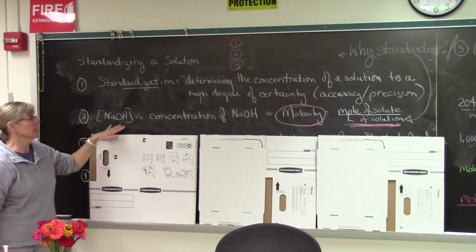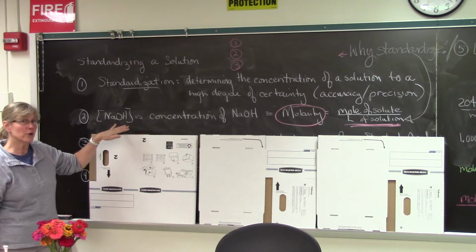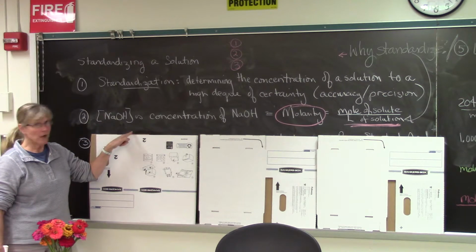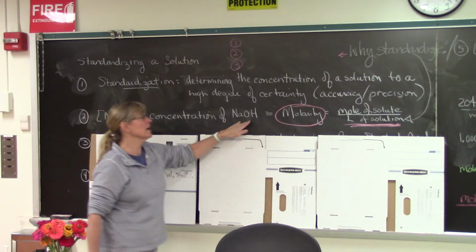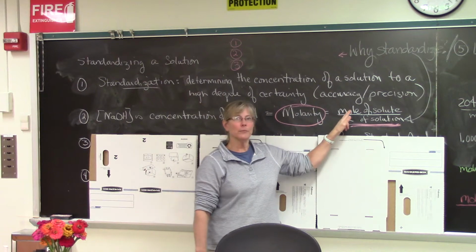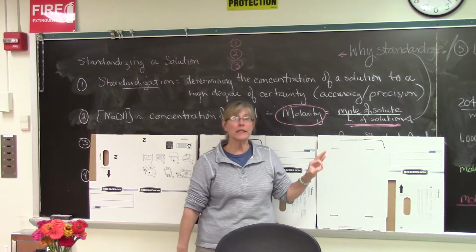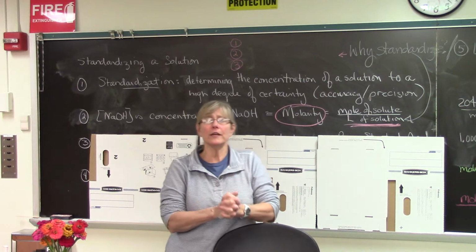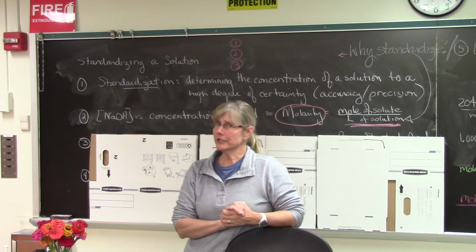And we represent the molarity of sodium hydroxide, which is actually what we're going to be standardizing this week. Sodium hydroxide we represent in brackets, not parentheses, in brackets. So this represents the concentration of sodium hydroxide, which is molarity. Molarity is simply moles of a solute per liter of a solution. Now, I'm not going to write it on the board because you should know this from high school if you haven't listened to the lectures this far yet.